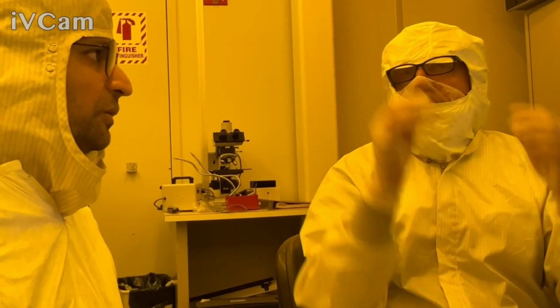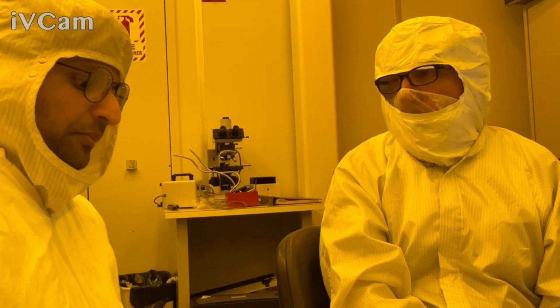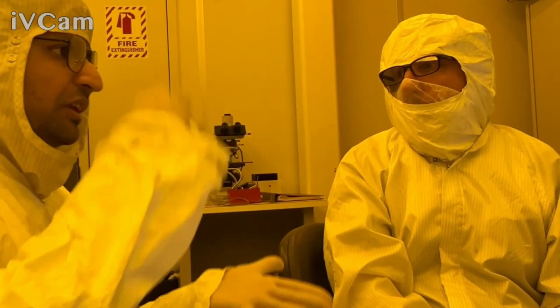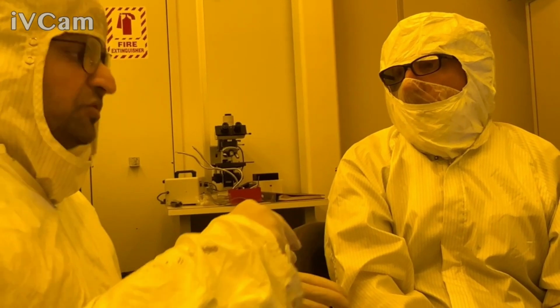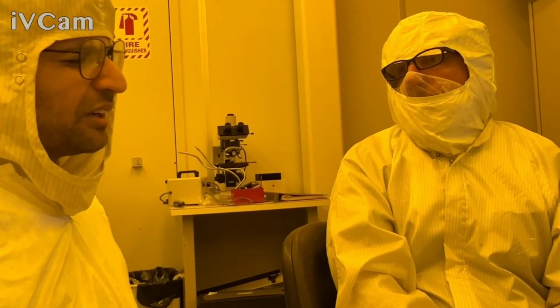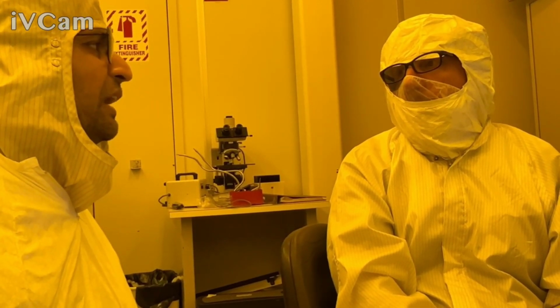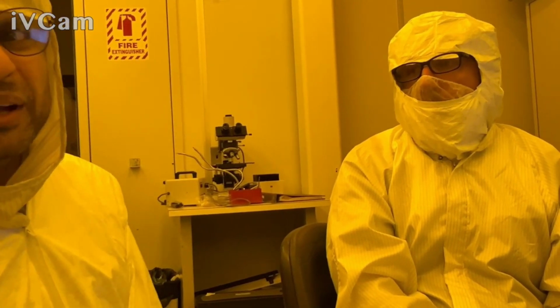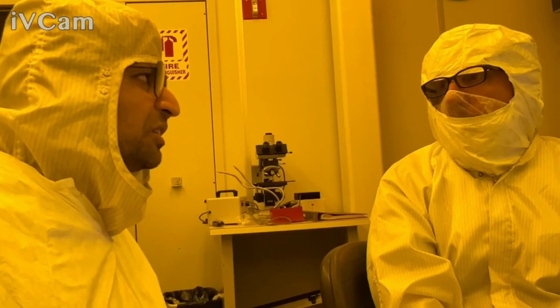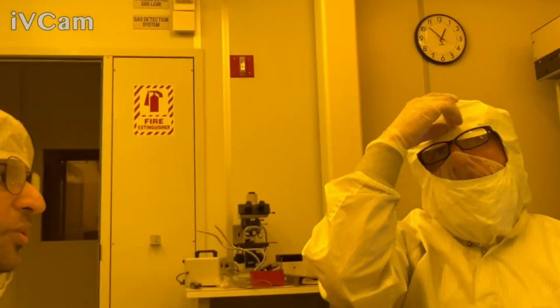It is. So, because if we grow the thin film, AFM gives the pattern like this, right? Yes, AFM. So can this tool also do the same, because our films are, let's say, a few microns thick, and then surface roughness will be around 100 to 200 nanometers. Because a 1 micron film will have roughness around 100 to 200 nanometers. Oh, that's quite rough. Optically, that's very rough. So, it's sample dependent.